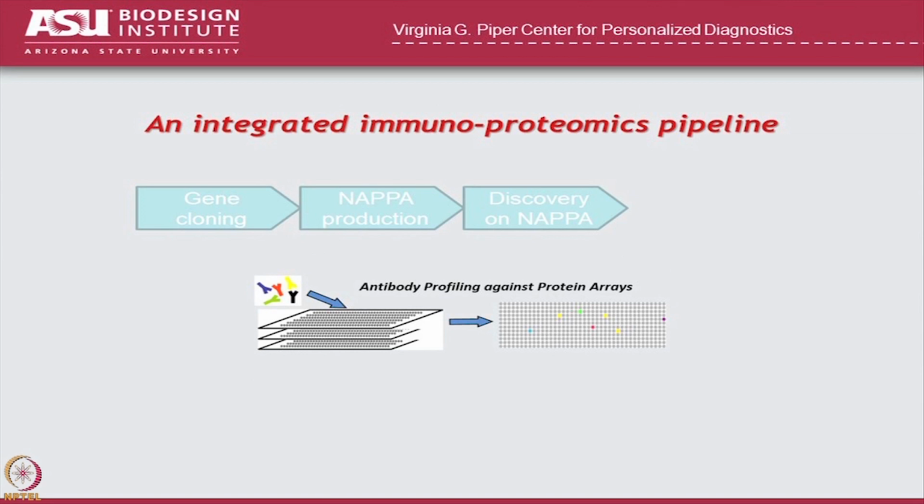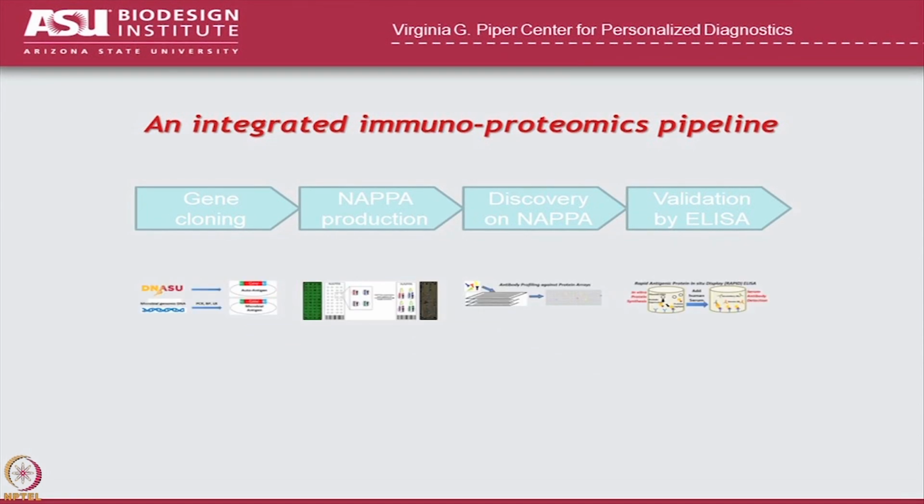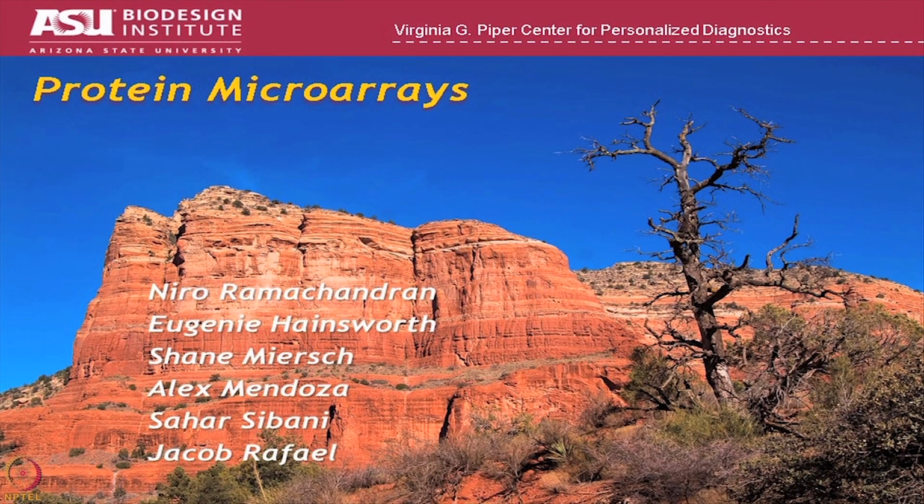Then we'll talk a little bit about how to do discovery on the platform. And then finally, nothing you do works if you don't go back and validate it. So that's kind of like the whole end-to-end process. So let's talk a little bit about protein microarrays, right? What are they, and why do we want to do them?